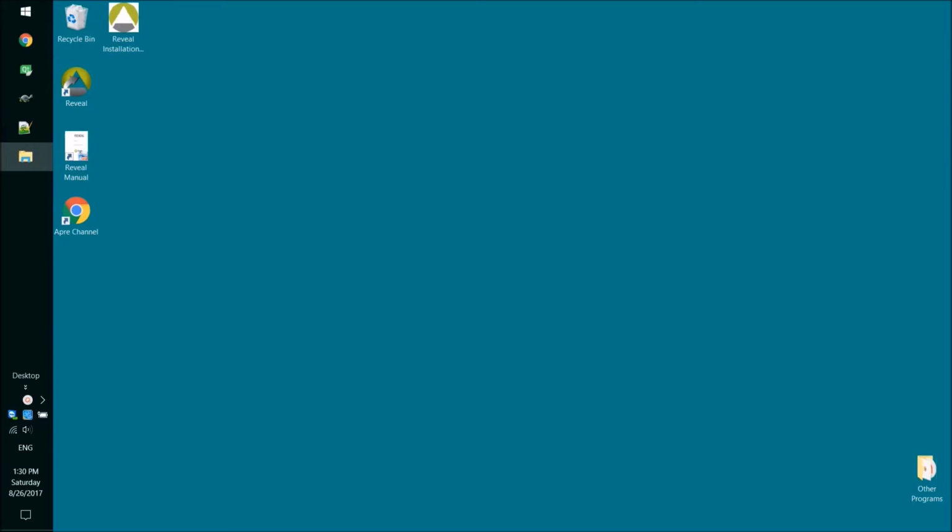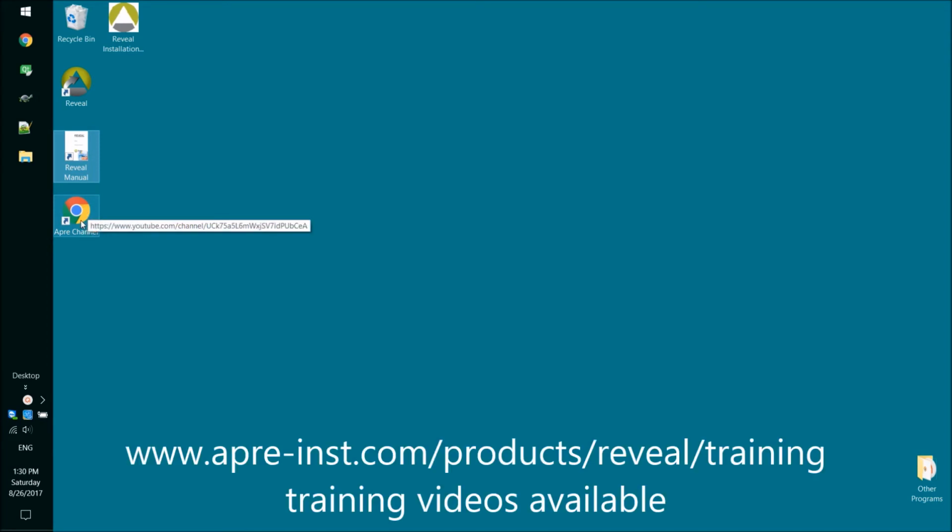Let's look at the desktop. You can see a shortcut icon to launch Reveal, a link to the PDF manual, and a link to Apre's YouTube channel, where reside Reveal instructional videos regarding operation and configuration of Reveal. Apre's website also links to these training videos.